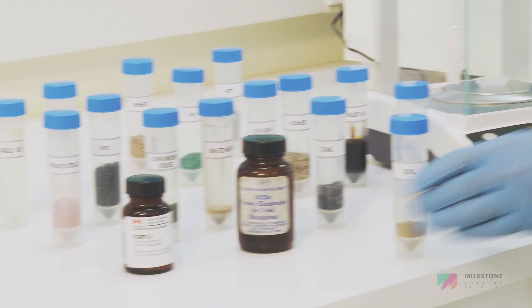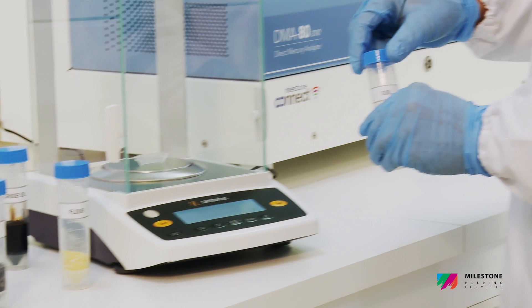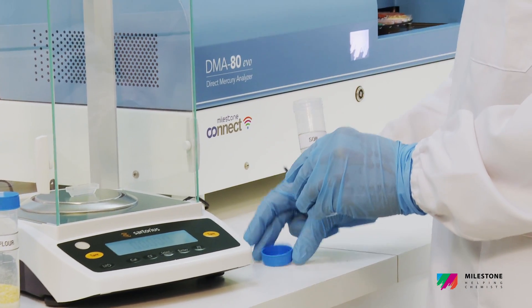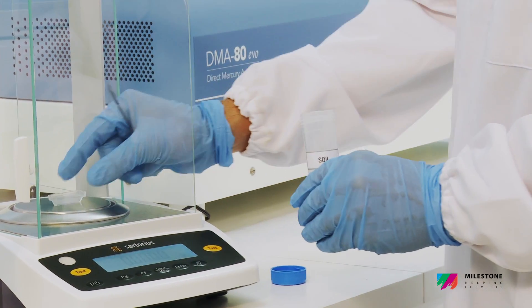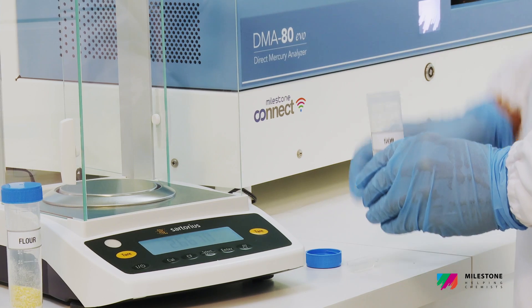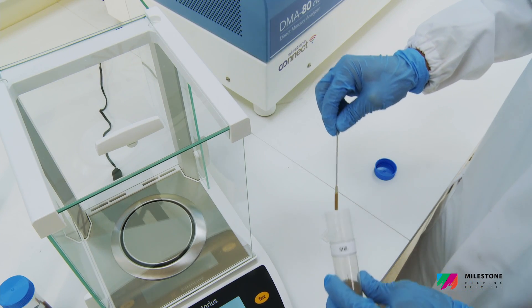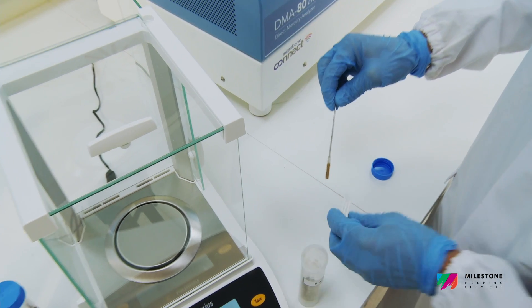Direct mercury analysis offers an inherent ease of use, simplifying mercury determination to its roots. The DMA80 EVO directly analyzes any sample in as few as 6 minutes.